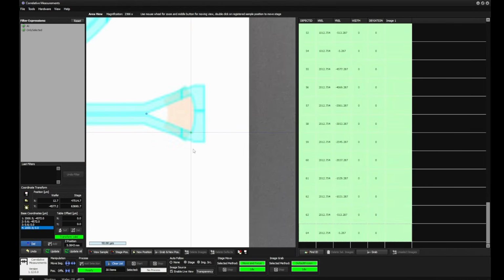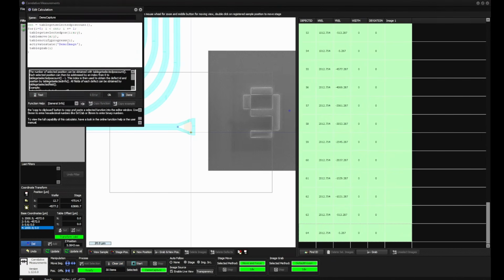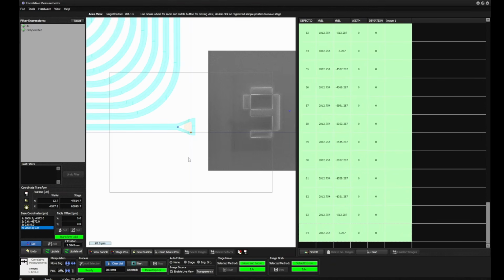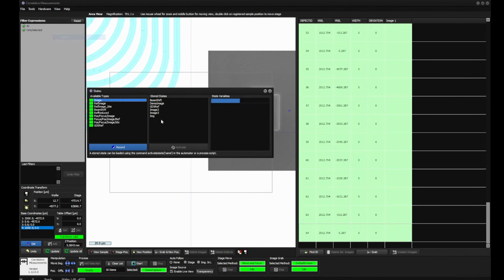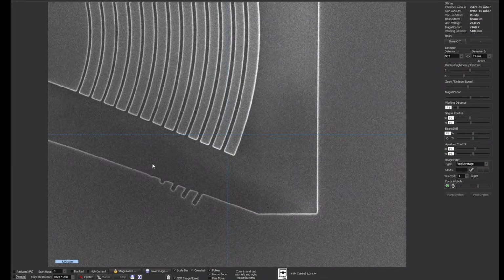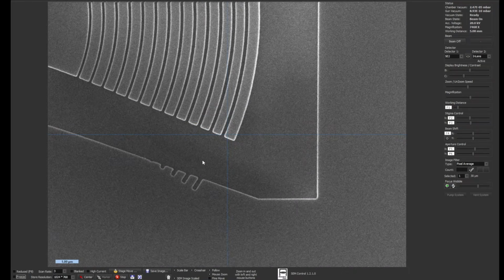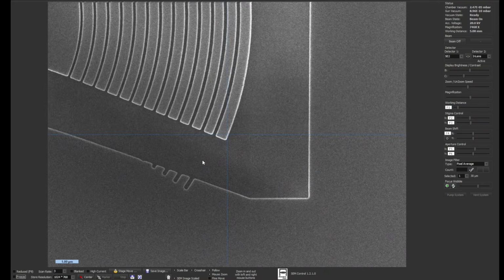If we now want to image this, we have the capture recipe here. I used the demo image. Then let us redefine this demo image. I will go to this corner here, something like this.